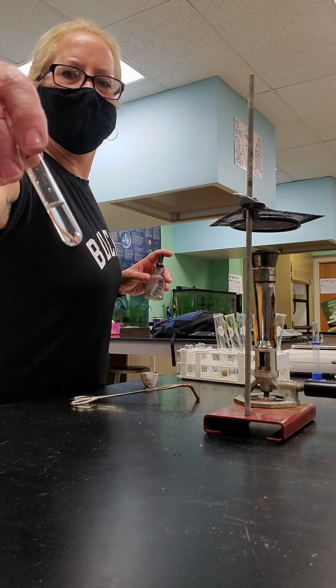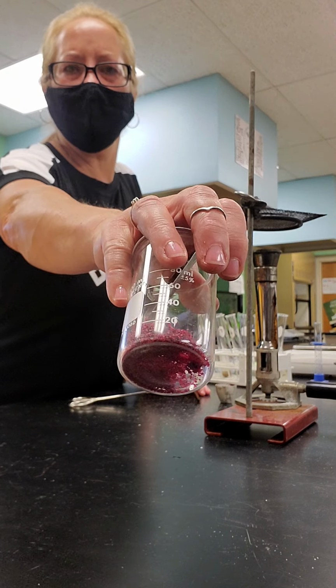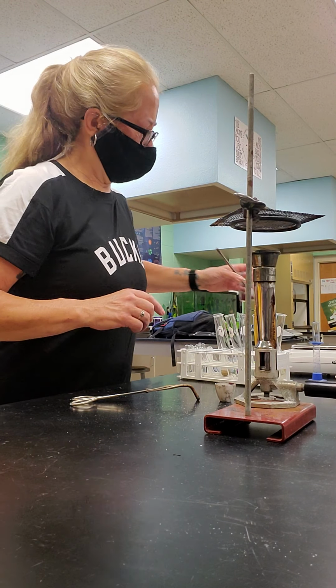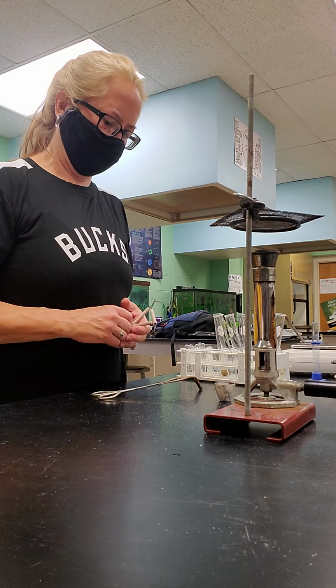That's good. All right, now we're gonna let that sit for a few minutes here in the test tube rack. Next, we're going to take a scoop of cobalt chloride, put it in the crucible. This time we use our clay triangle, and a light. Okay. This only takes just a few seconds.